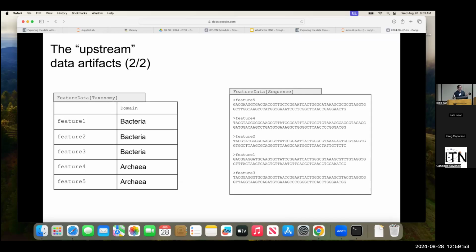Now, because we only have limited time here, we're not actually running through all of these upstream steps. We just use the jargon upstream and downstream. Basically, the way we use it, it means before you get to the feature table, which is the QC, where a lot of things vary. If we're doing metagenome analysis, upstream of the feature table we're probably doing different things than for amplicon analysis.